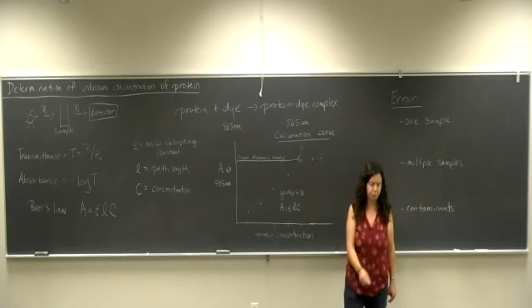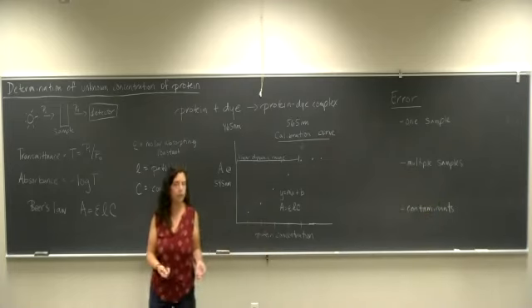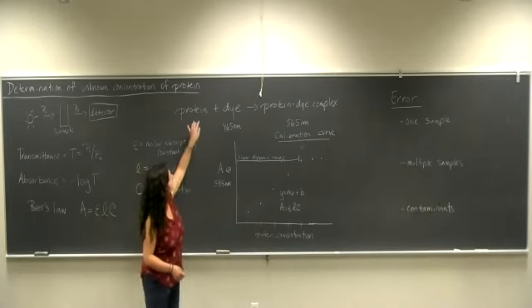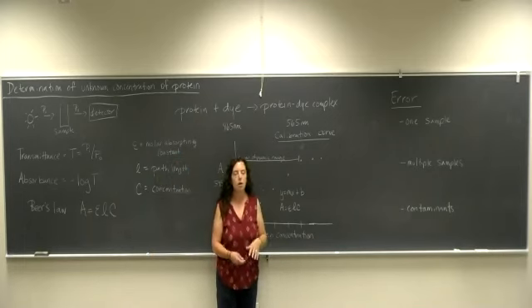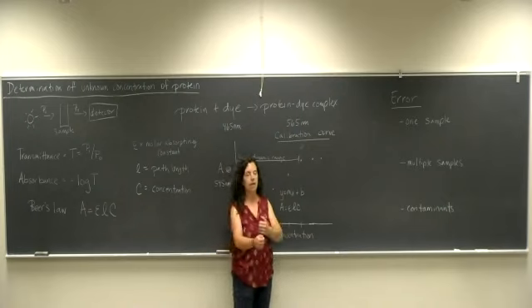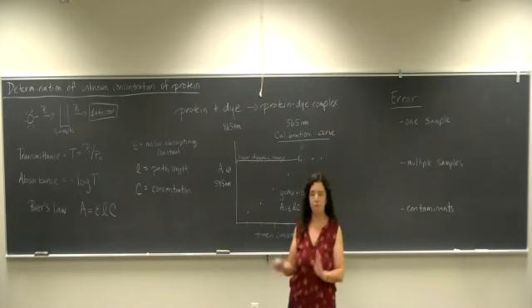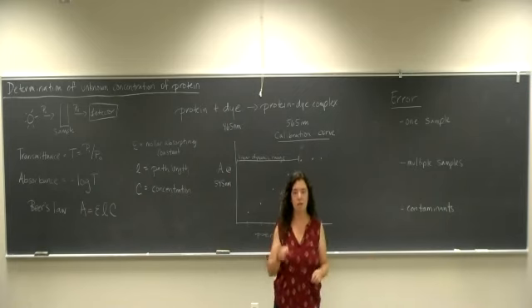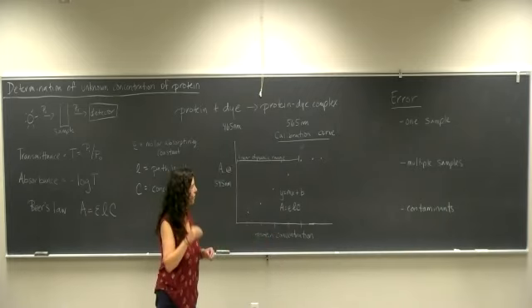You can use the absorbance that you measured for your unknown to determine its actual concentration. You'll be doing this project and calculating some of the error. This reaction, the dye with the protein, is time sensitive, so you will have to plan accordingly. Make sure that when you're preparing your samples, you leave enough time for yourself to actually take the measurement. Give yourself 30 seconds to swap out samples and put them in.